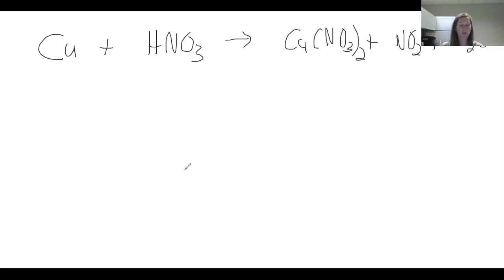Okay, so you need to balance it. I said that before when we looked at the pre-lab, and you had to write all of these reactions balanced. So the balanced chemical equation, I just have a 4 there. I think that's it. Oh, it's got a 2 and a 2 here as well. Okay, so there's the balanced chemical reaction.